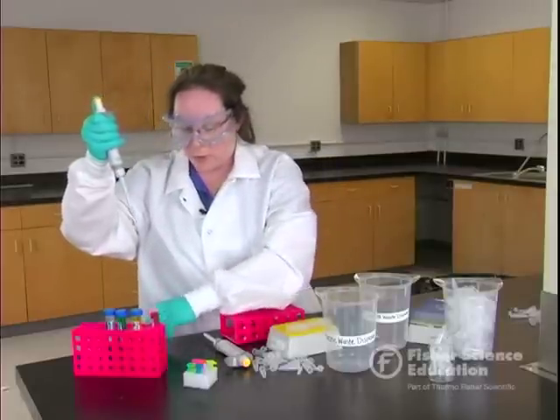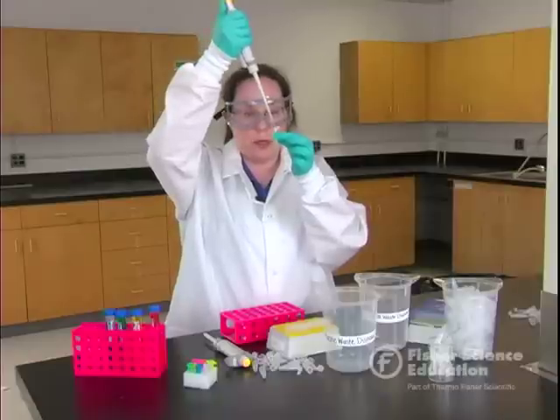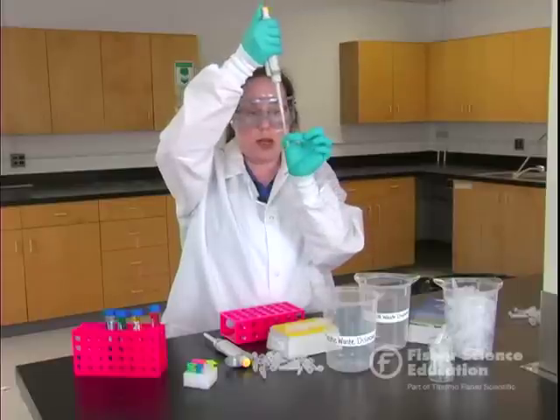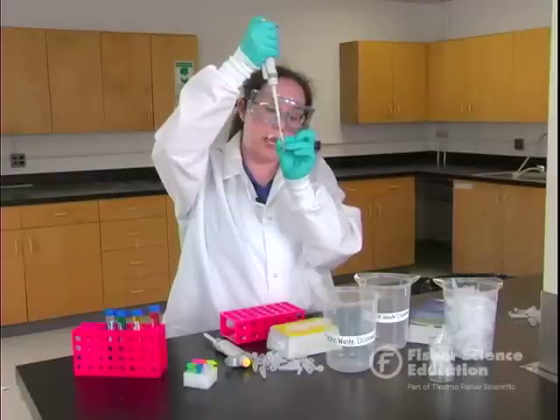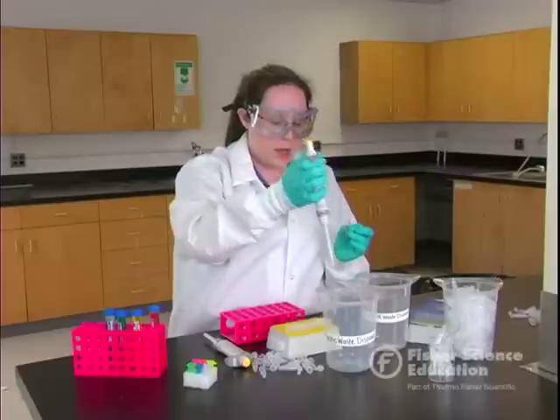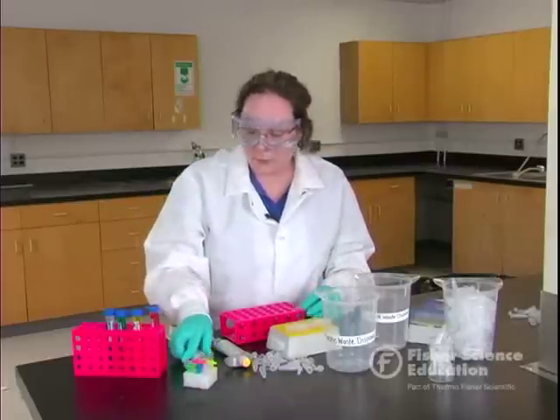Always recover your samples before pipetting into a new tube. Proper dispensing is going to be to the second stop. In order to dispense properly, you actually want to touch the side of the tube. Slowly go to your first stop — you may see a little bit of liquid left in there — then go to the second stop, keep that plunger depressed, slowly let go, back up, take your thumb off, and eject the tip.